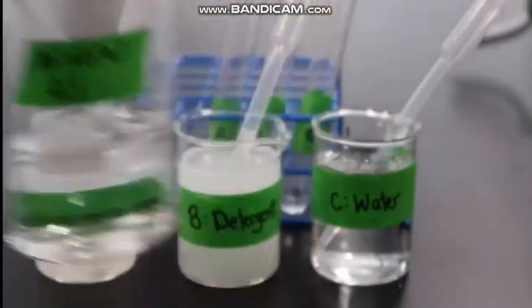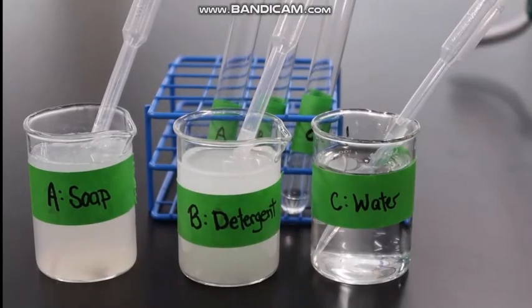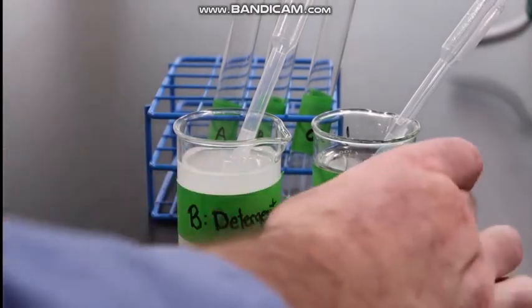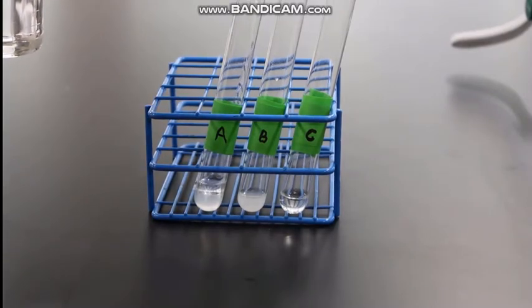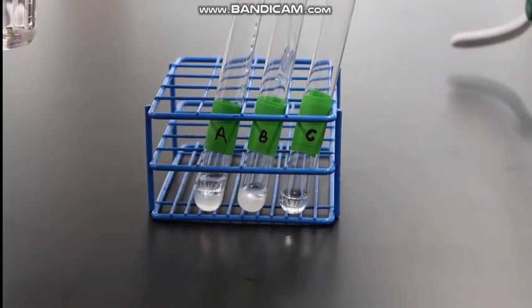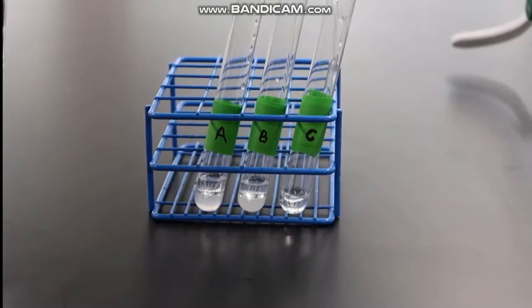The next property we want to explore is emulsification. We are going to add mineral oil to each of these test tubes. Test tube A has a soap solution. Test tube B has our detergent solution. And test tube C is our control, which contains water. To each of these, we are adding mineral oil.